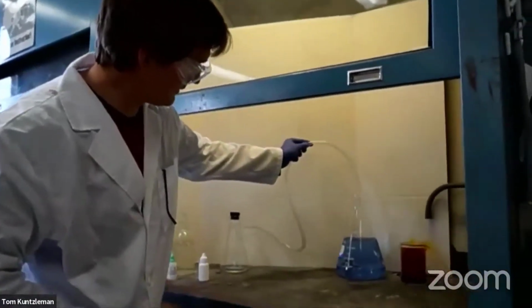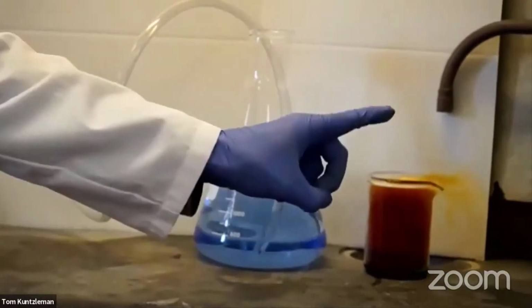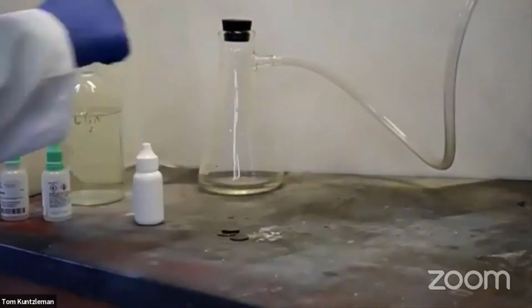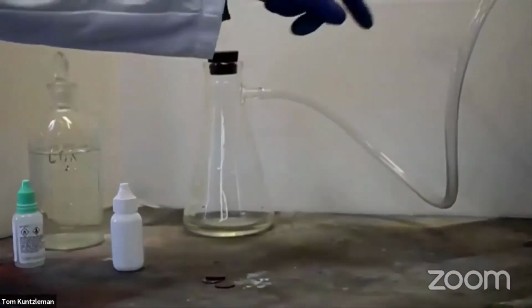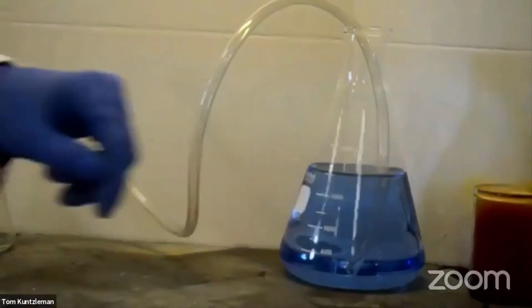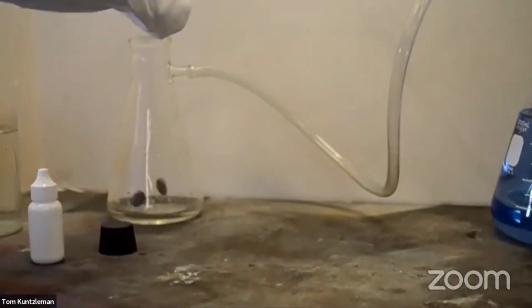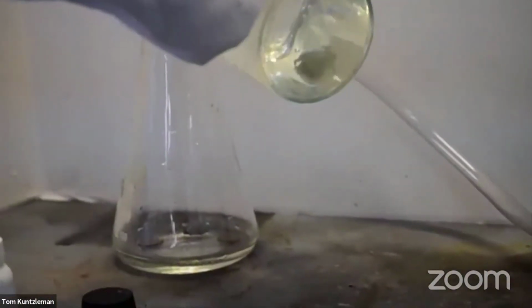I will place this in here. We're going to repeat this experiment. But this time, we're going to put the pennies in this flask, and I'm going to seal it. And then the gas that evolves should go through this tube, and it should bubble into our water that contains the acid-base indicator. Here we go. I'm going to add these first. Get this going.